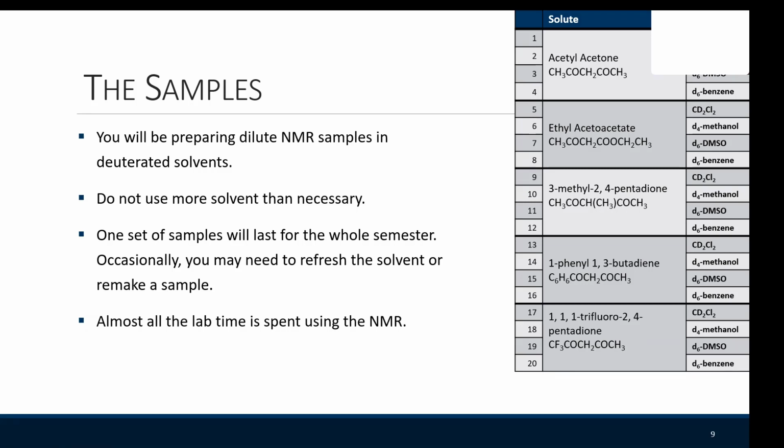On Canvas, I provided 20 NMR spectra from different compounds, and it's 5 different compounds, and 4 different solvents are used for each compound. So total, that's 20 spectra.